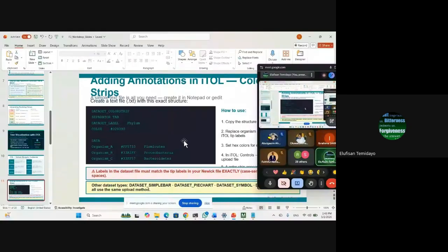So I will give them different colors manually, but the automated way will make your work faster. You just upload everything together and it gives you your tree in a beautiful format in the color that you want. But I'm not too familiar with this. I have used it before, but I don't use it often, so I'm not going to say I'm an expert discussing it. So I'm going to discuss the other way. Let's continue with iTOL now.